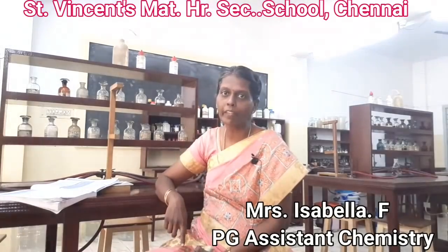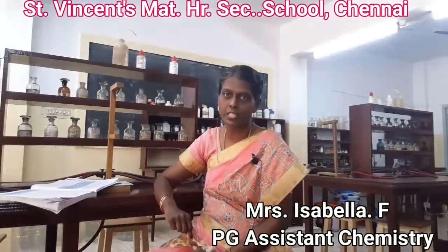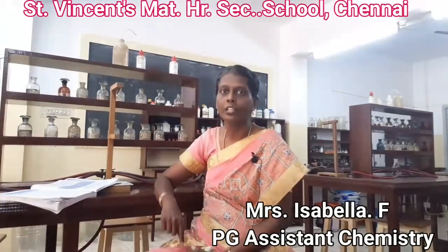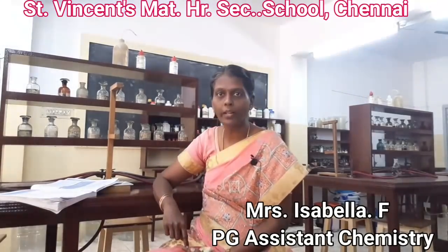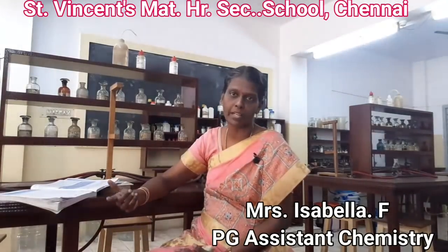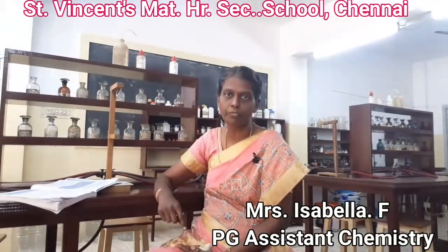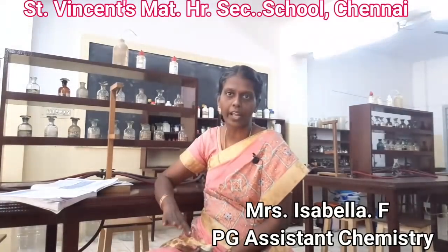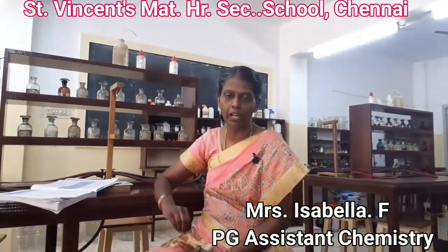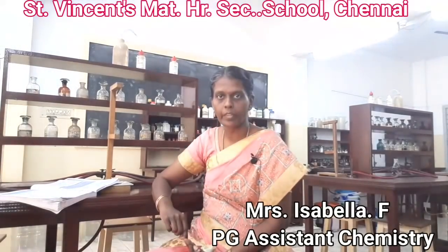The second one, when you take the burette reading, read it from top to bottom. So do not make a mistake in the reading of the burette values. The burette values will be read from top to bottom. That is the second one. The third one, when you fill the pipette. As I told you, the last drop of the pipette solution, you must not blow or tap the pipette on the sides of the conical flask. So wait gently for 1 or 2 seconds for it to drain out, and that will be 20 ml. So don't blow or tap the last drop which is present in the pipette.